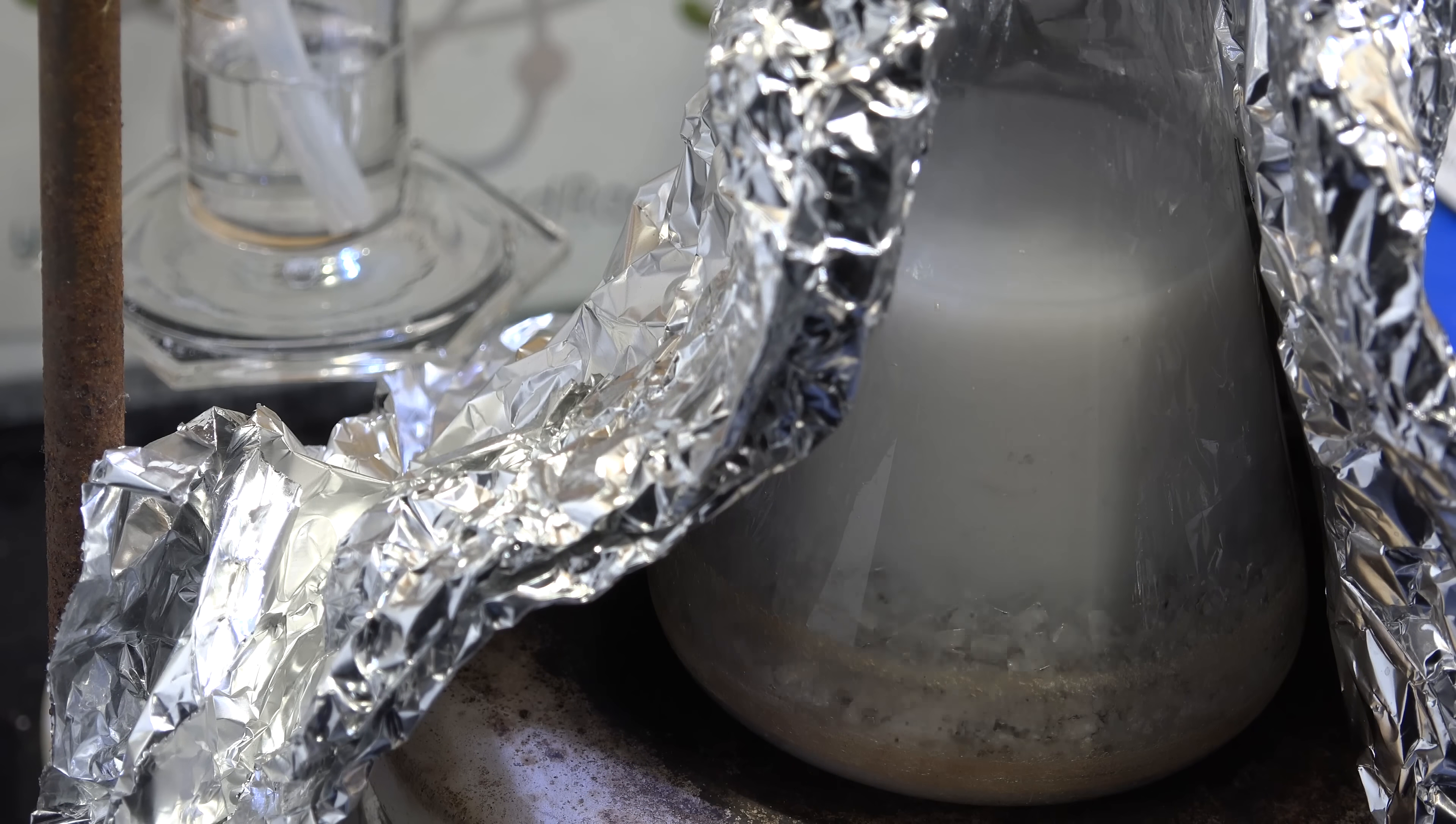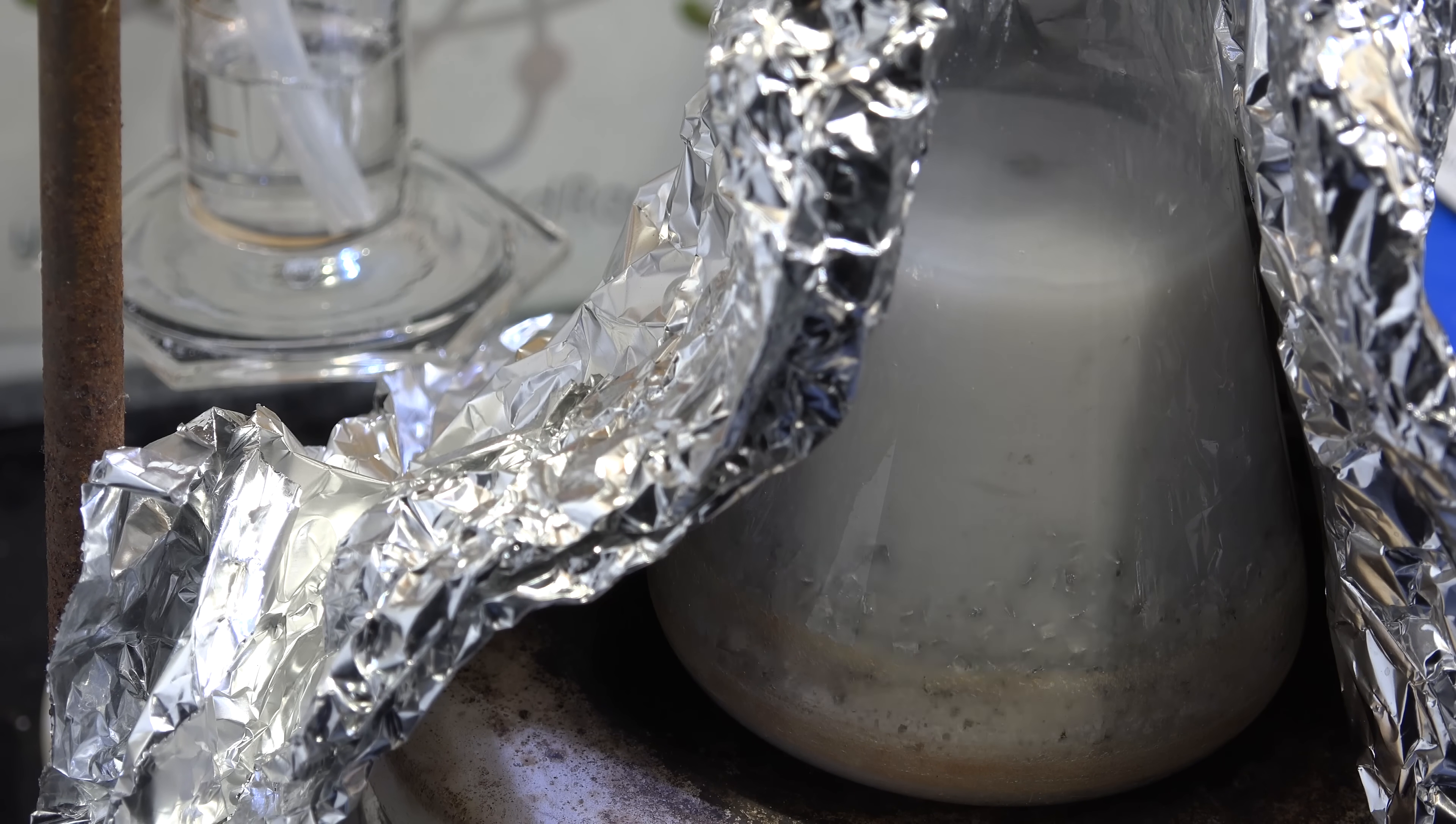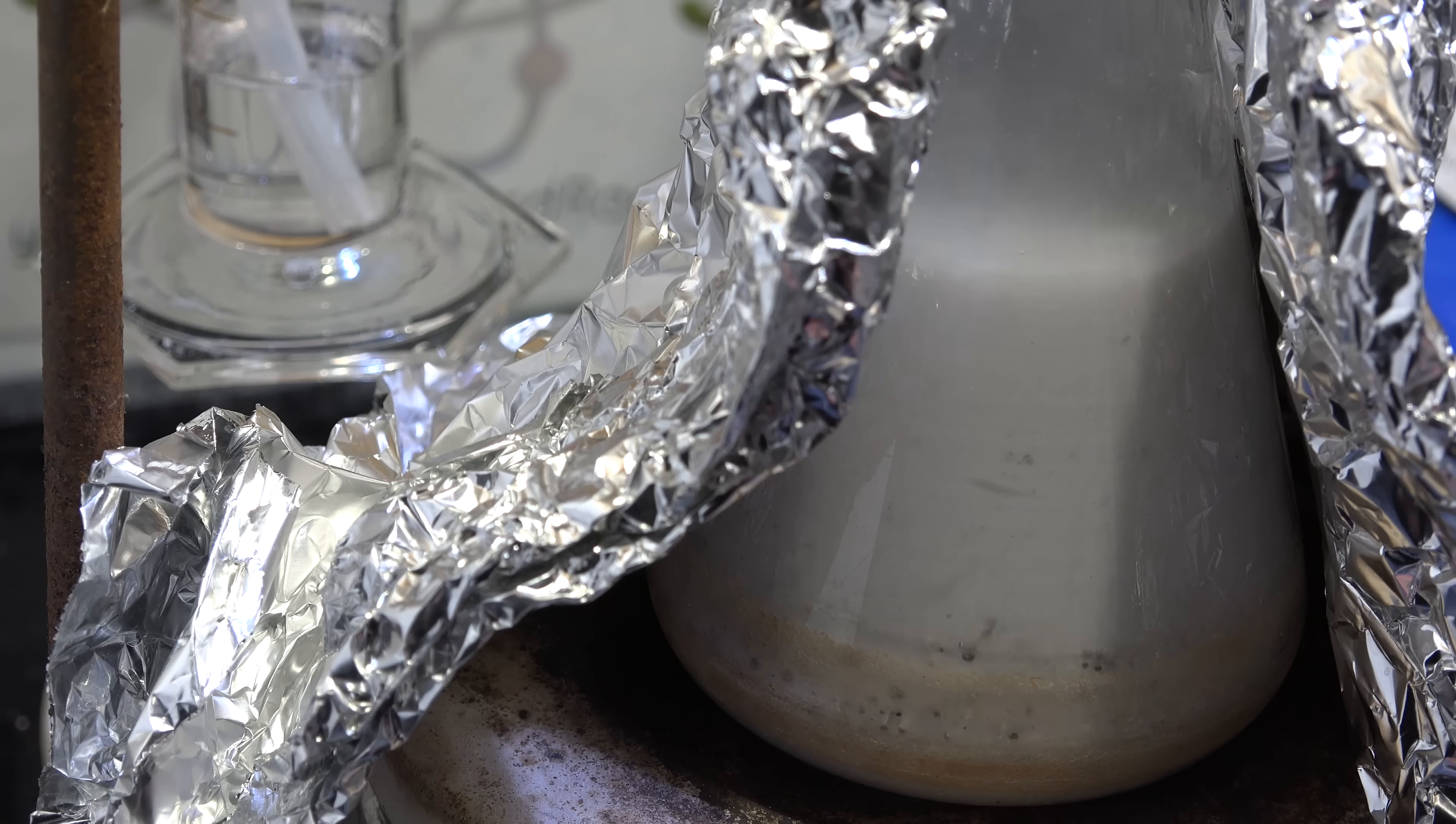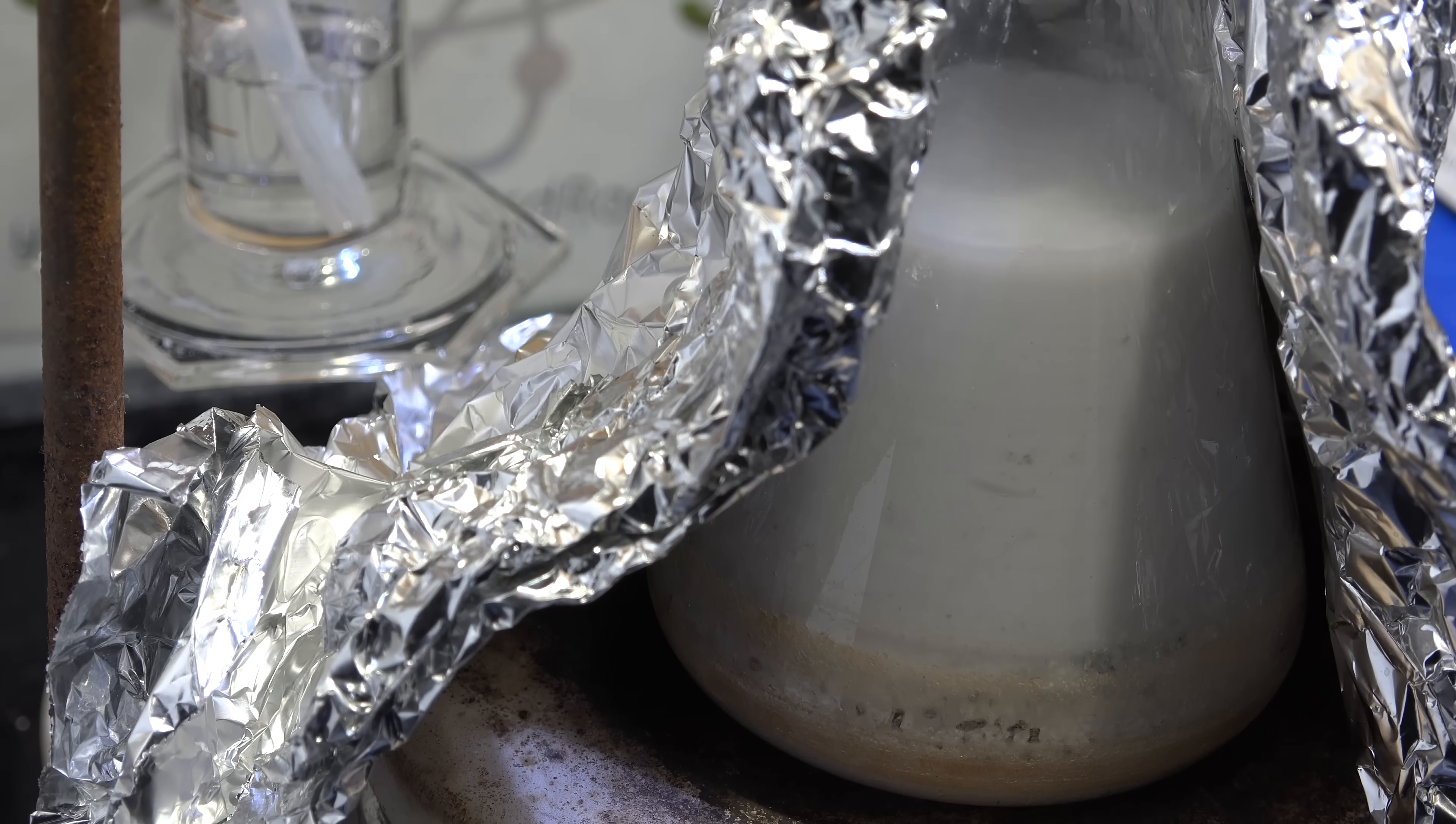Unfortunately there are some major issues. One is time, spending three days per reaction to generate about 10g or so of sodium is, to put it lightly, not a very efficient use of time. That's one of the big reasons this month has been devoid of videos. I've been wasting a lot of time on sodium related experiments. I really need to build a second fume hood so I can do more experiments at once.